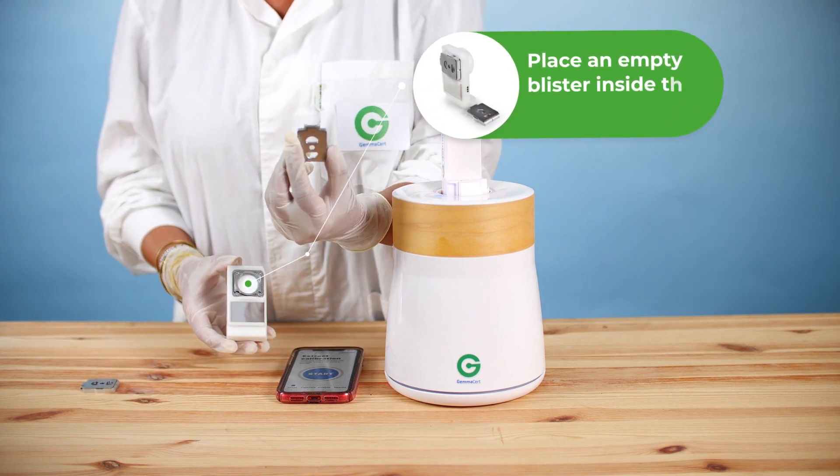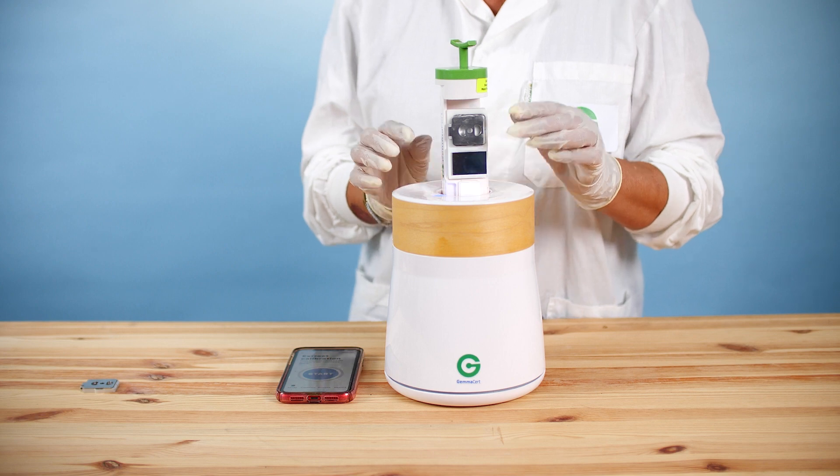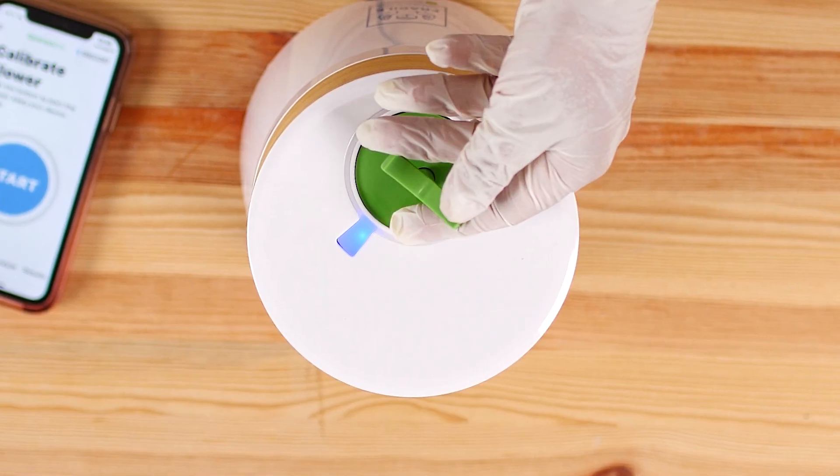Place an empty blister inside the extract accessory, then place the accessory into the device. Drive the drawer down gently using the green handle.